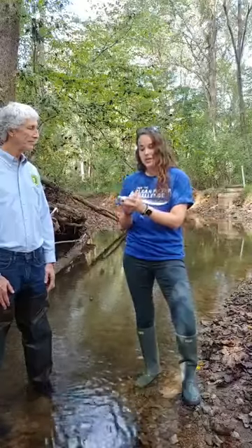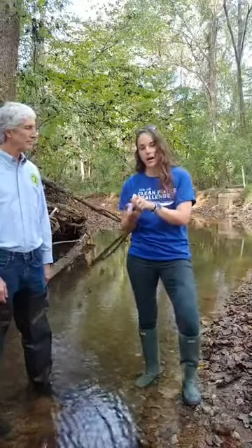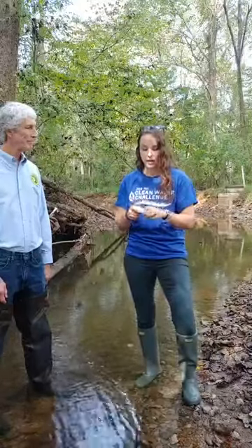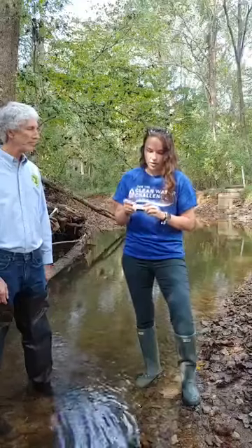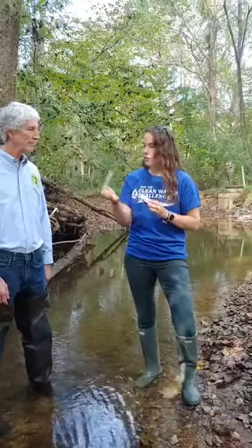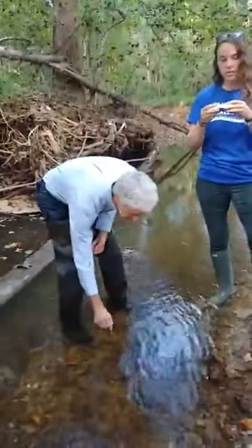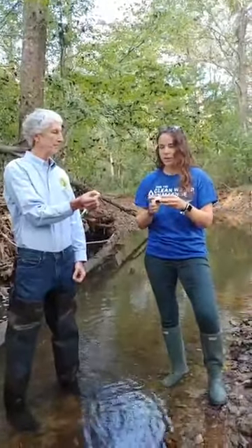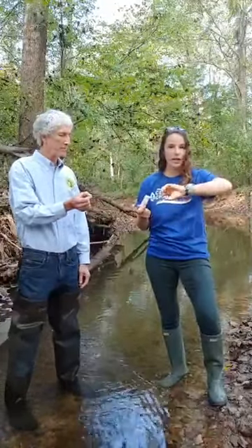The next thing you need to do is read the instructions, because depending on the lot of test strips that you have, it might have different timing for your test. Our instructions say to dip the strip into the water for one second, then pull it out and hold the strip level for 30 seconds. Make sure you have a timer out and you're watching the clock.